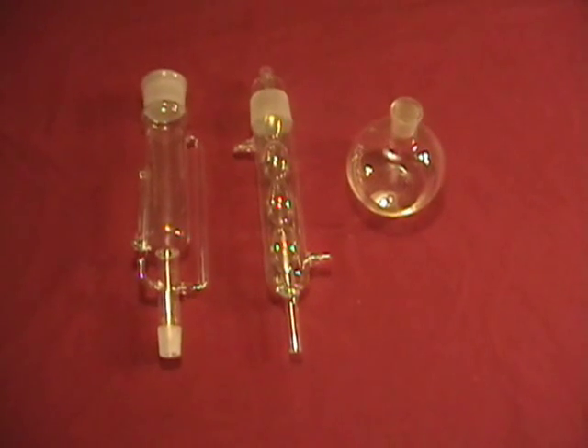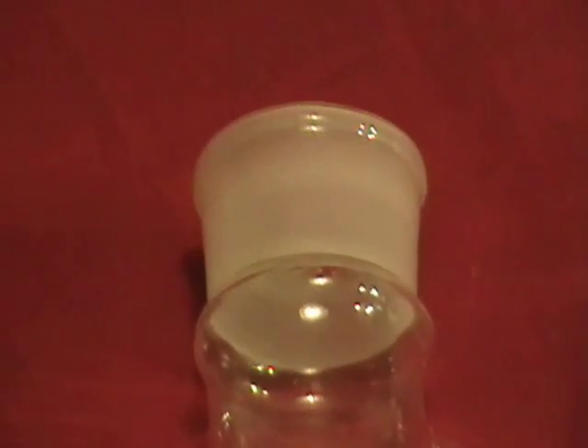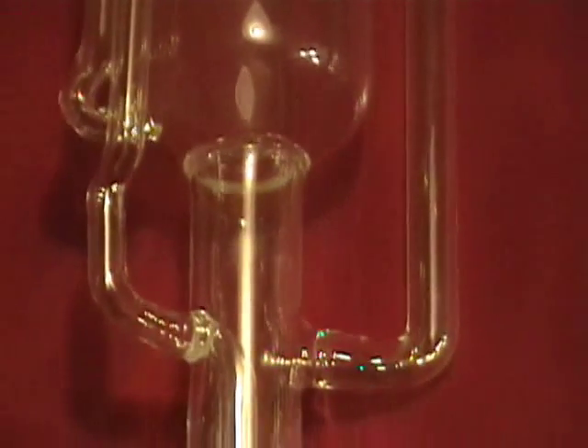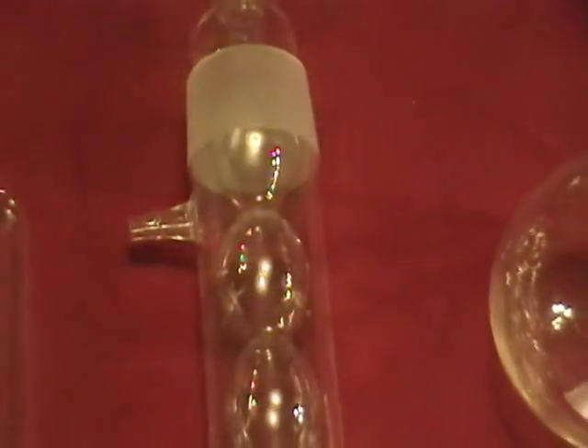This is a new 500 milliliter extraction apparatus. The extraction body has an overall length of 13 inches. The outside diameter of the extraction body is 50 millimeters. The ground glass joint from the extraction body to the 4-bulb alum condenser is 50-40. The ground glass joint from the extraction body to the 500 milliliter flask is 24-29.